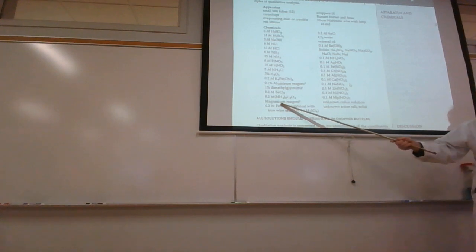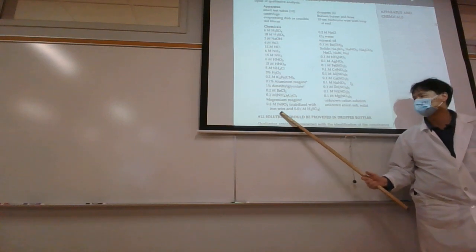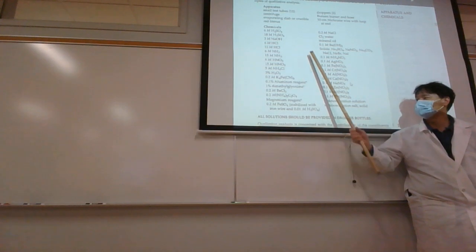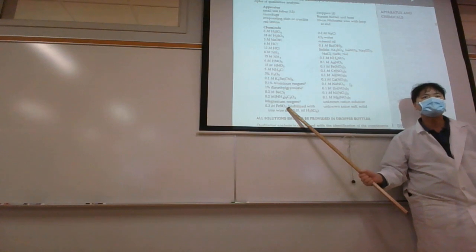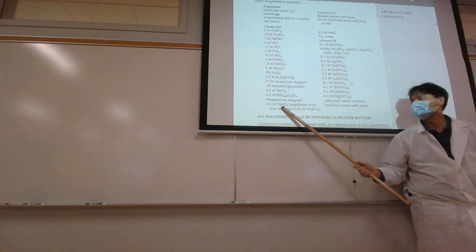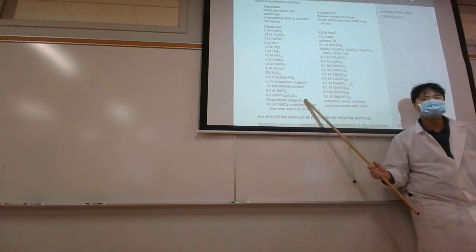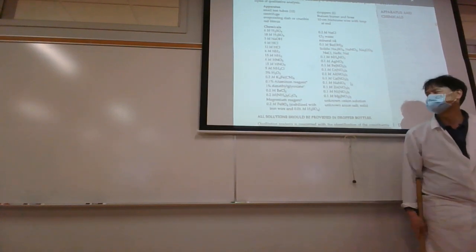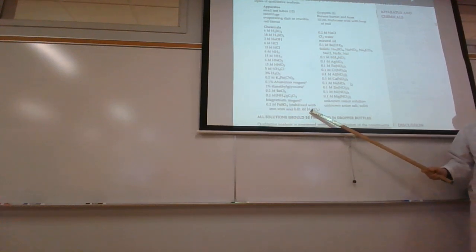Magnesium reagent is another dye. Iron(II) sulfate is green. Iron(III) is yellow. If our green iron(II) sulfate turns yellow, then it's gone bad. It's just been oxidized. So this one you leave the cap on, so it stays fresh longer. Otherwise, the shelf life of iron(II) sulfate is not very long. It'll be oxidized by air pretty easily from iron(II) to iron(III).